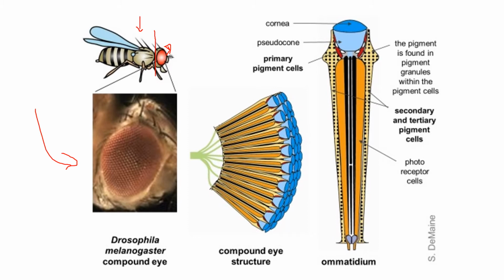So, for example, when you have the chromatography paper, you cannot put it directly into the solution. I will show you in the video. They show you one way to do it. We do it in a slightly different way. Either way it works. The idea is that the paper doesn't fall in the liquid, but it's much easier in the lab to explain how we do it. The previous video describes more or less all the steps of how to do this.